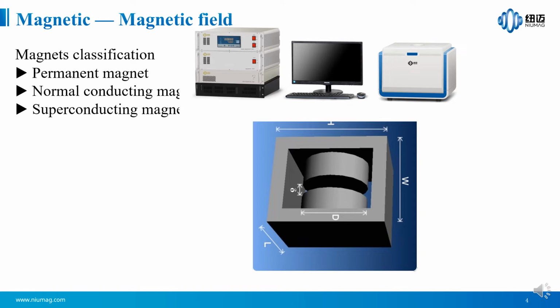The magnetic yoke is mainly used to restrain the magnetic field and keep the magnetic field balanced and stable. The yoke prevents the magnetic field from leaking out and interfering with external instruments, and also protects the magnetic field from foreign magnets. The yoke usually uses soft material with high permeability, such as the silicon steel sheet. This is the magnetic field of the permanent magnet.